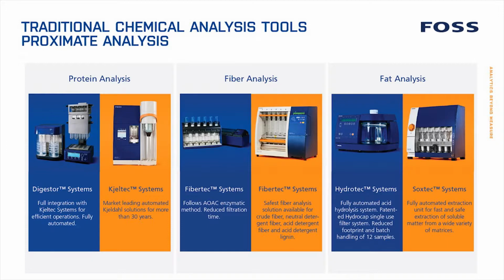While there are drawbacks and limitations to these traditional methods, it must be understood that they're still extremely important. These kinds of solutions are widely used and accepted, produce accurate results, and are commonly used in feed companies' central laboratories or in third-party commercial testing labs. While these tools are invaluable for the industry, they do not offer the rapid on-site analysis that feed manufacturers need today because they're simply too slow.